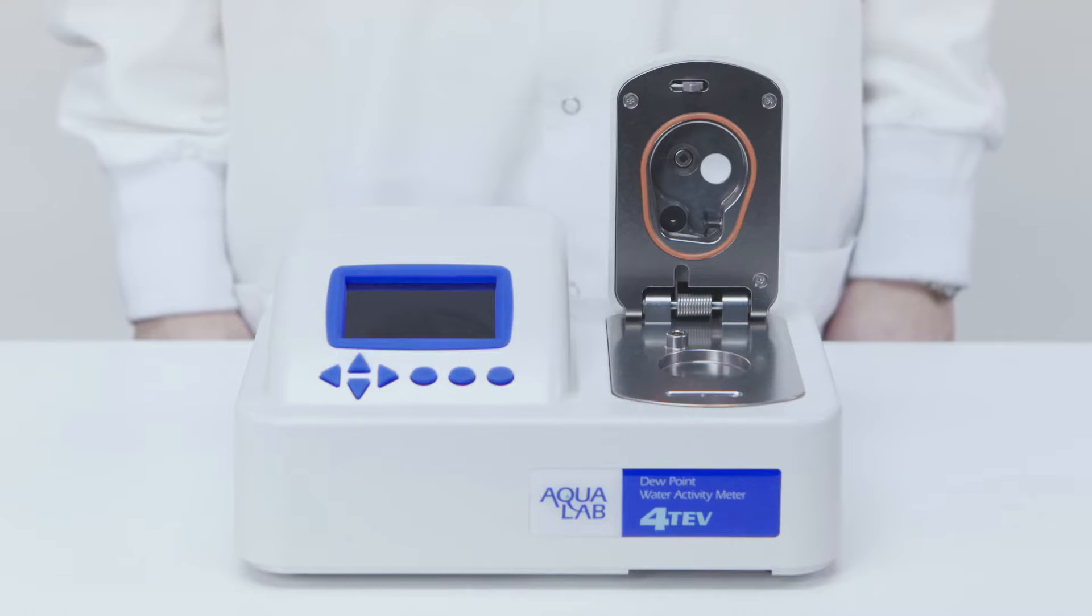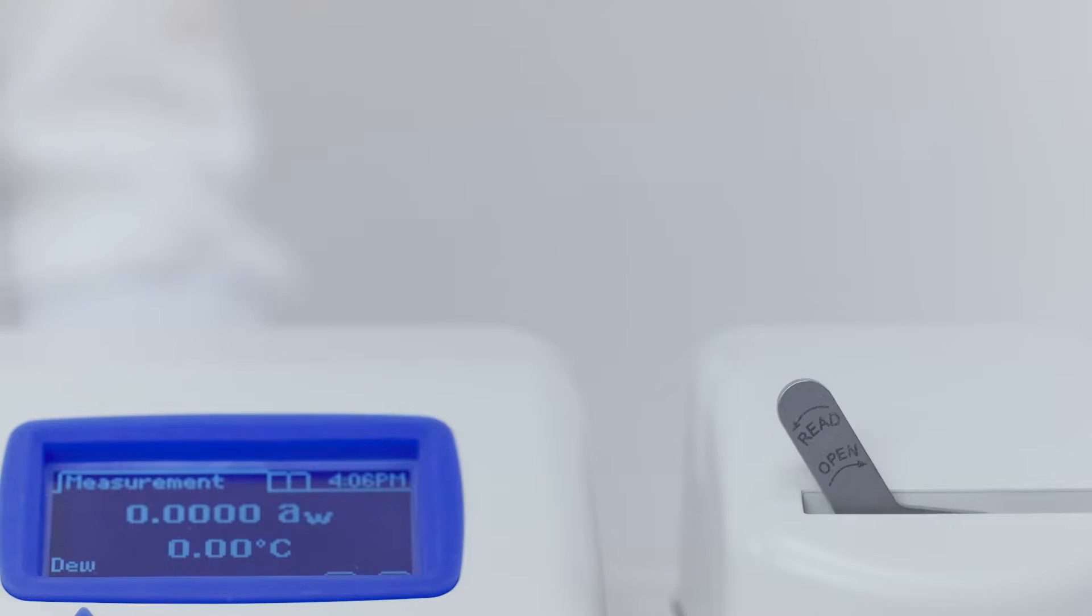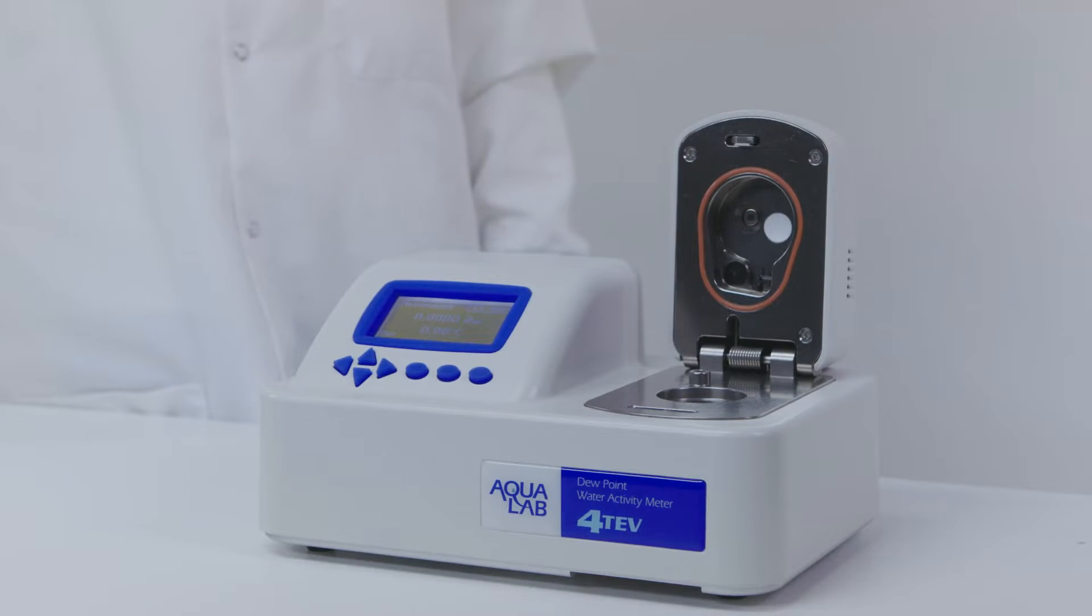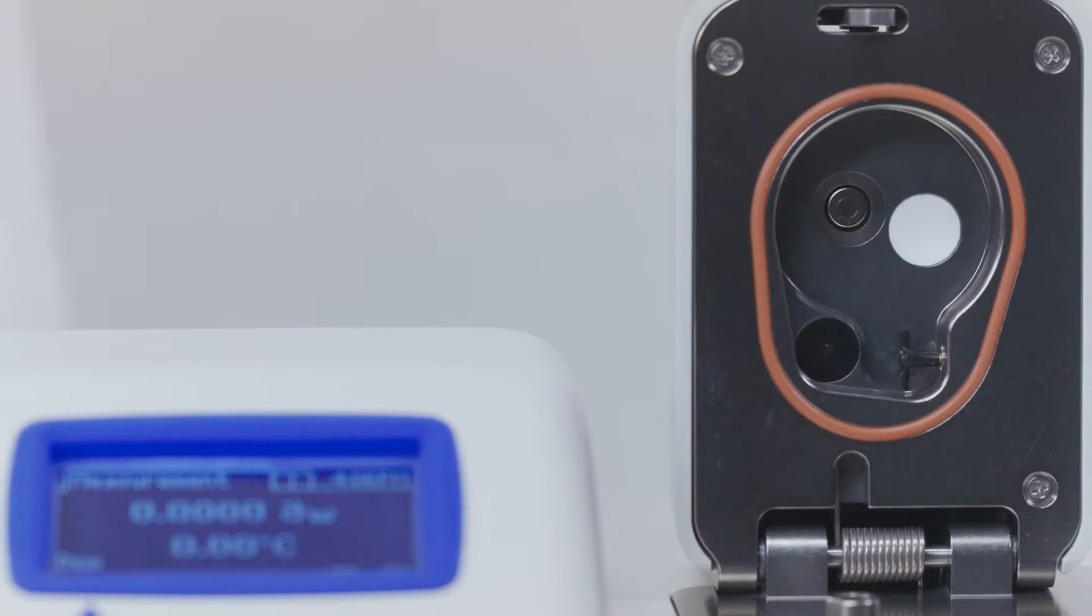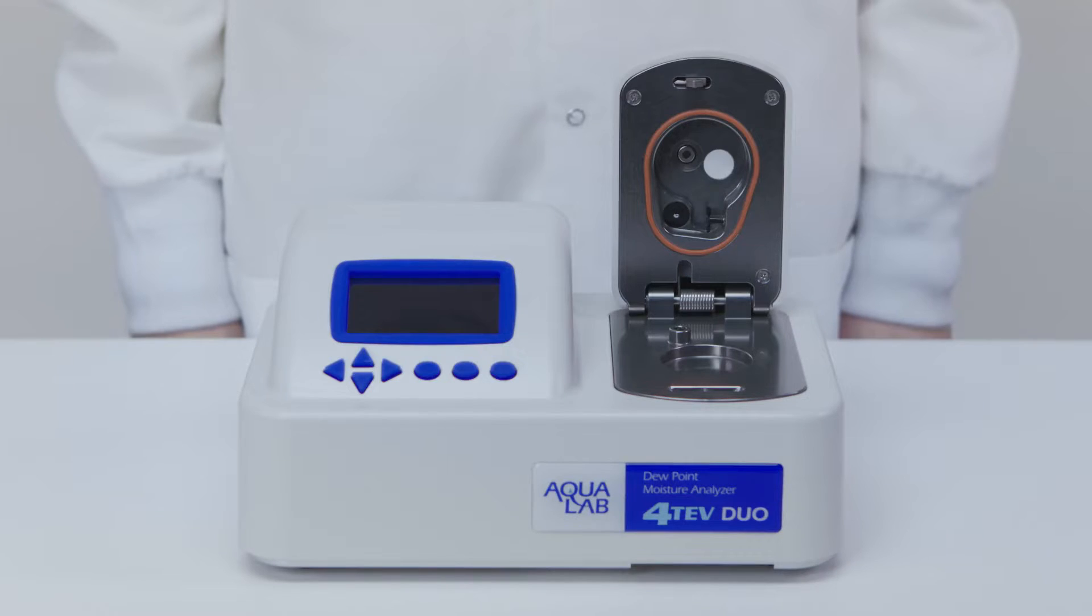The Series 4 TEV features a capacitance sensor alongside the chilled mirror sensor. The capacitance sensor is a secondary measurement method. It's good enough for many situations, but not on the same level as the dew point and tunable diode laser sensors. The Series 4 TEV lets you choose the sensor you want, using the higher accuracy dew point sensor most of the time, and the capacitance sensor for samples that have volatiles in them.